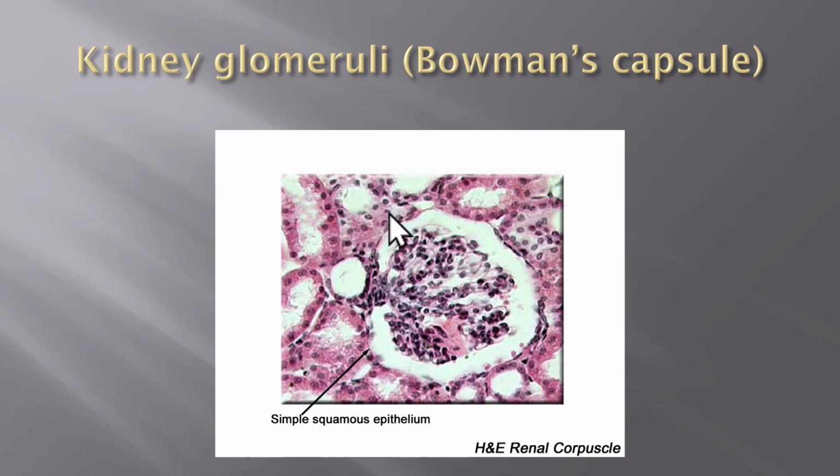I don't know what it is, right? But coming in very flat, and then I change into something else. So we've learned flat cells, squamous, and we don't have another layer underneath this that's the same as this layer. So this is a simple squamous epithelium.